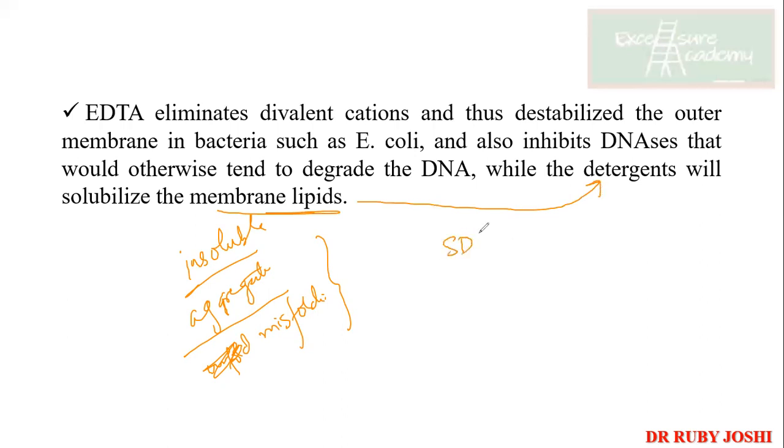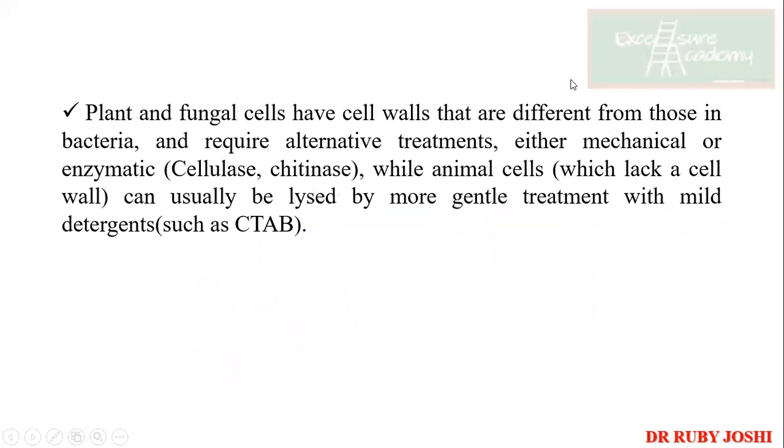Now here we don't use SDS. You might have heard of Triton X-100 or X-10, something like that. Yes? Have you ever heard of it? Yes. So such kinds of detergents are used if you're working on membrane lipids. See, previously I said if I'm working on proteins, I won't be using them. But if it is membrane lipids or membrane proteins, then I need detergents in order to isolate and purify them. Okay, it all depends on what kind of question there is.